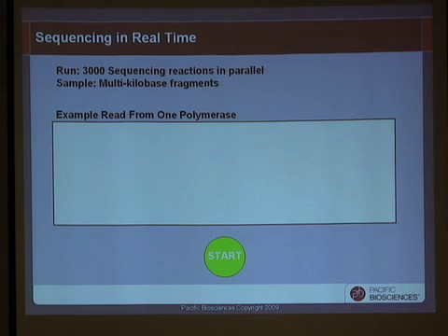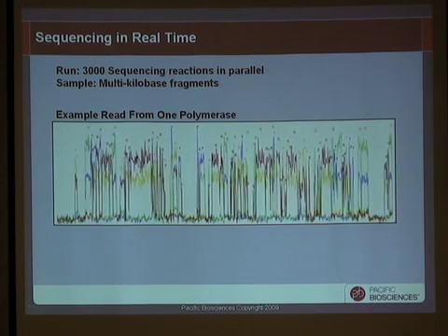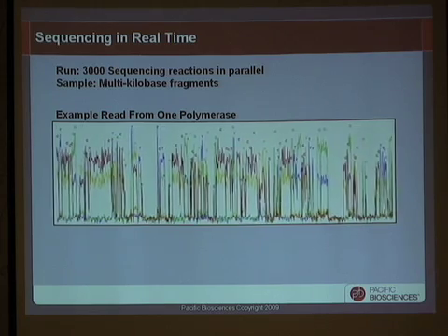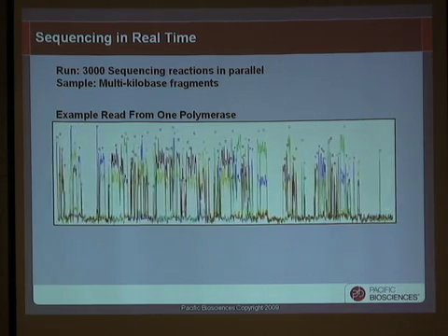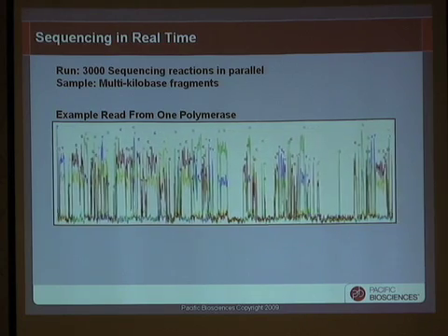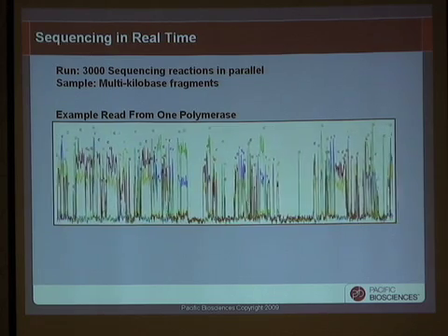I'm going to show you a trace from a run very much like the one that you saw there. I'm going to just get it started because it's going to take a while. So this is what the information coming out looks like, where there are elevations in the fluorescence, and because we have the spectral information, we can identify which fluorescence channel is responsible for that elevation. The sequence is spread out like a conventional electropherogram. There's an elevation on the C channel, we call it C, etc. And there's one pulse for each base incorporated. So in homopolymer regions, there's a separate pulse for each base incorporated.